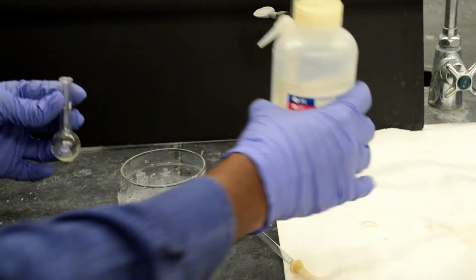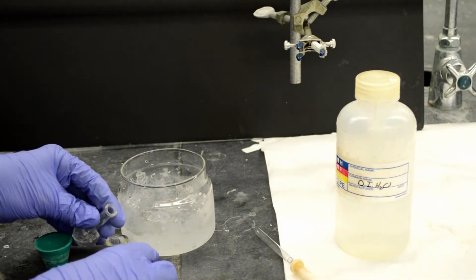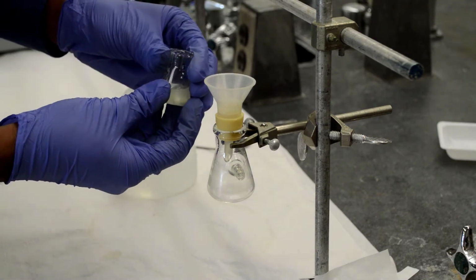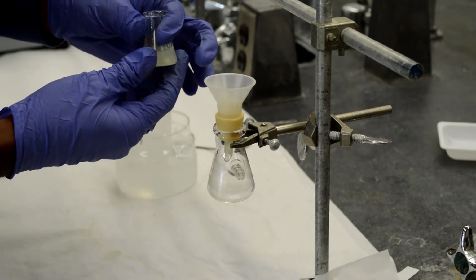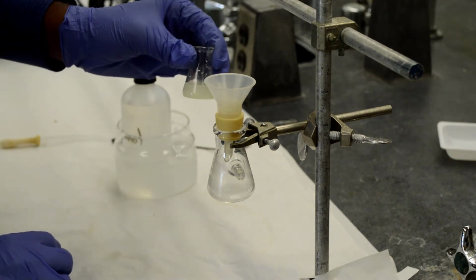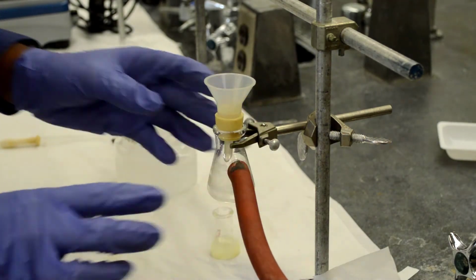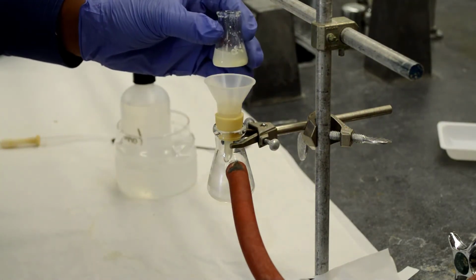And we need to rinse off this reaction flask with some DI water. Okay, so here is our reaction mixture in ice. All of the ice has melted. The next step is filtration, separating the precipitate product from the liquid water. So let's do the vacuum filtration. Turn on your water, check the vacuum, connect the vacuum tube, check the vacuum here, and transfer your product.